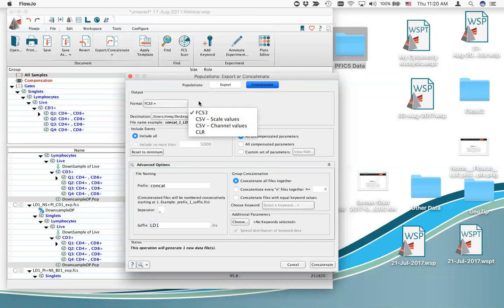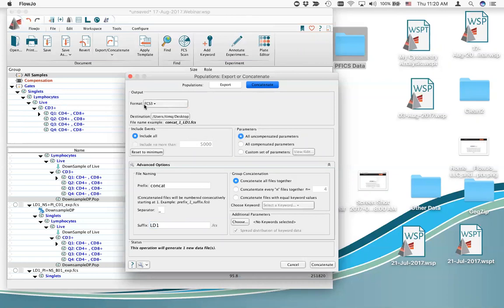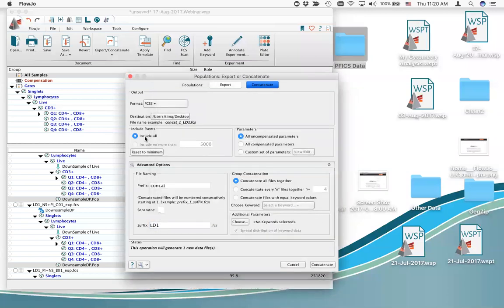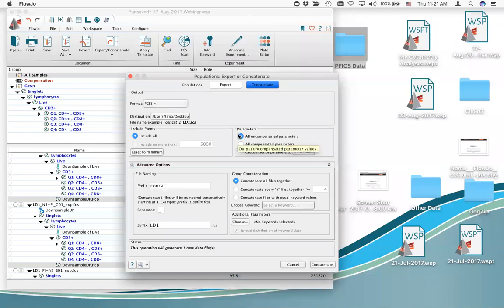FCS3 is our format. Put the file at your chosen destination — in my case the desktop. Include all events since I've already done downsample, and include all uncompensated parameters. This is critically important: if you want your gating tree to apply to the new concatenated file, leave parameters as all uncompensated parameters. The number one mistake people make is choosing compensated parameters — you want the raw data. The file will come with a compensation matrix just like a normal FCS file.